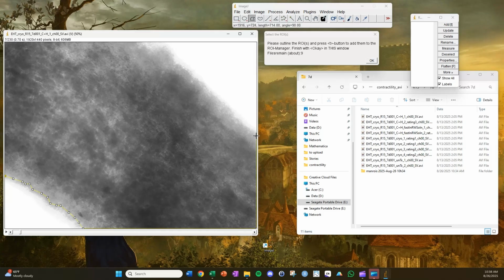This is related to what I was saying earlier in terms of why I'm choosing a reference frame of contraction. If I draw the region of interest like this, I think it'll be much more consistent, because the empty space in my videos at least is variable video to video. And so I want to draw the region of interest in such a way that the analysis results are not dependent in any way on the empty space around the tissue.